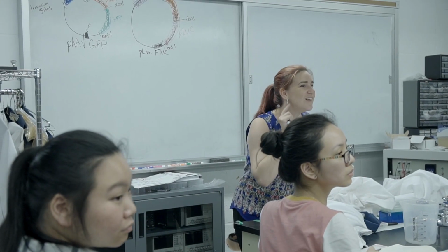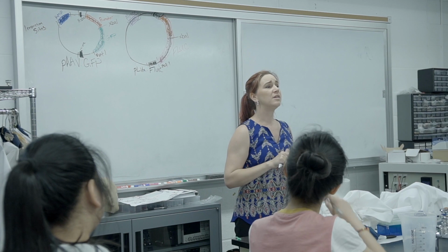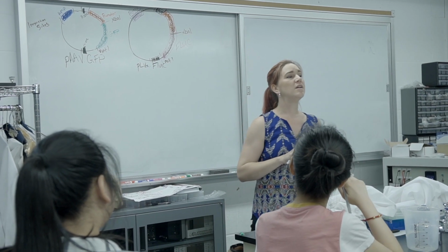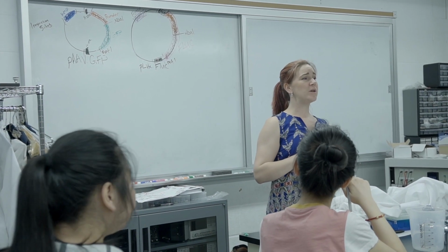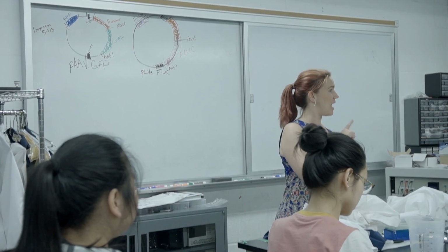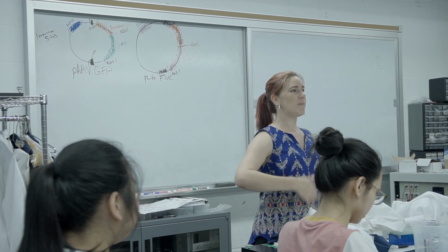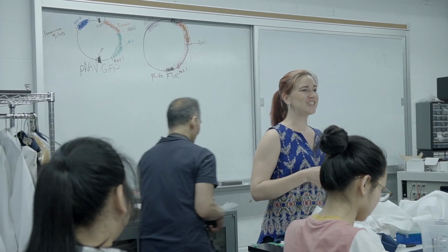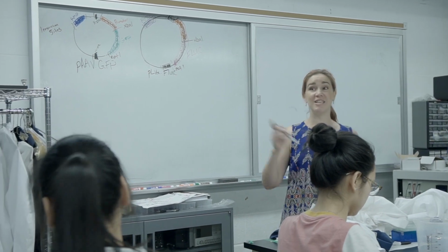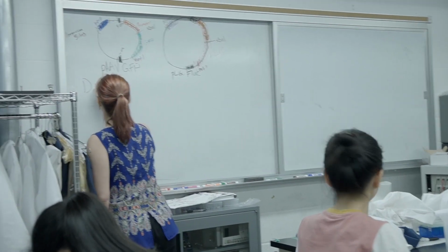Yeah? I need to cut it out. Does anyone remember what the cutting it out is called? We use a restriction enzyme. And do we know what that reaction's called? Ligase. Not ligase, but we'll get to that, so remember that answer. What happens when you cut up all your food in your stomach? What's that process called? Digestion. Right, so we're going to digest these plasmids with our restriction enzymes. So first, we digest.